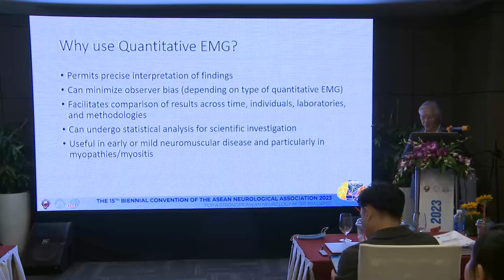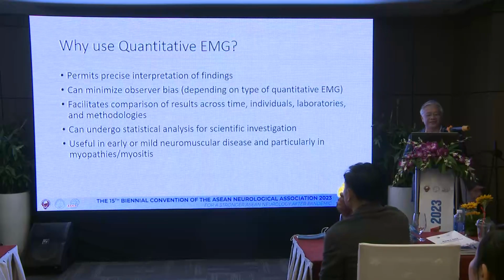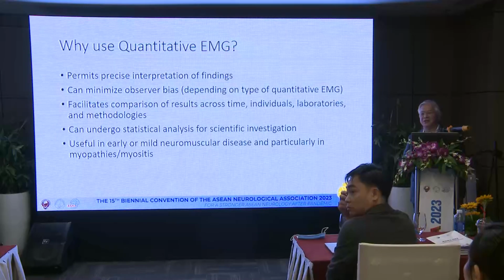So why do you, like I said, it takes about an hour to do a muscle, so it's actually pretty time consuming, and it takes a lot of patience as well. So why would you want to do this? Well, it gives you a more precise interpretation of findings.